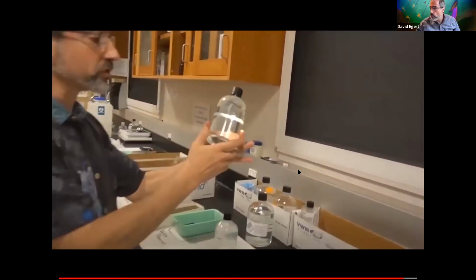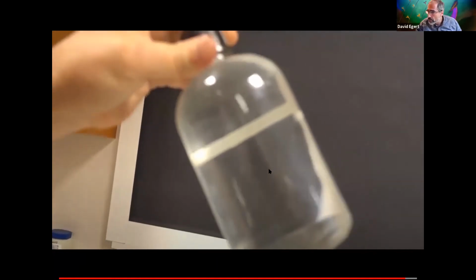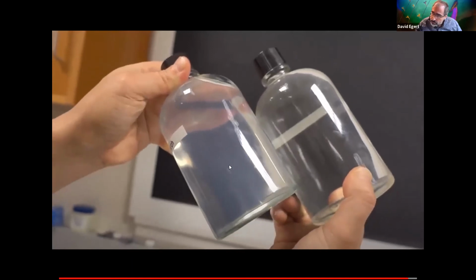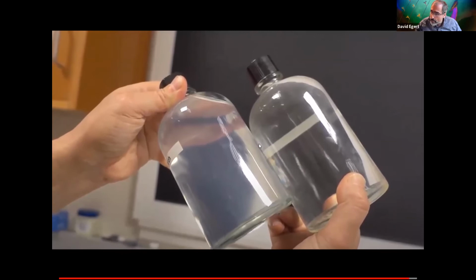Now this is the sugar water, a true solution, which by definition is not going to scatter light, so it's basically transparent. Whereas when you have a starch solution, I don't know if you can notice it here, a colloid does scatter light, which basically means it's cloudy or milky looking.